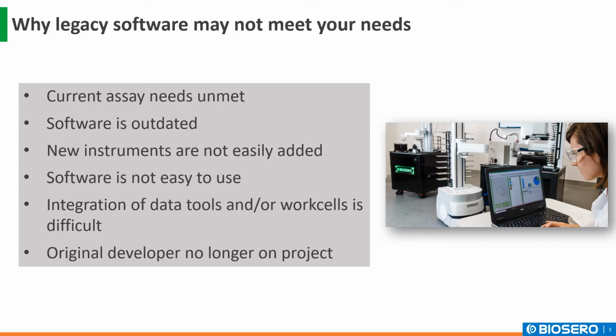The software can be outdated. It lacks capability, is not user-friendly, and is often not supported by the vendor with active updates. Legacy scheduling software is not user-friendly. It can be inefficient, arcane, and not flexible, all around difficult to use. It does not provide tools such as user interfaces and monitoring tools to guide the research scientists through their process. It can be difficult to incorporate and optimize new methods. Error handling is often a nightmare, often requiring a complete system restart.